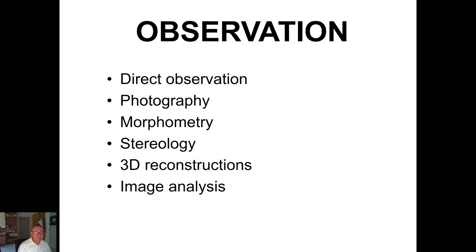Quite a newer thing is photography. It was discovered at the end of the 19th century and used in microscopy during the first years of the 20th century. So it's approximately 100 years old, photography in microscopy. But it was a very big improvement in the collection of pictures, because it was possible to capture the specimen and to get the picture without any long drawing.